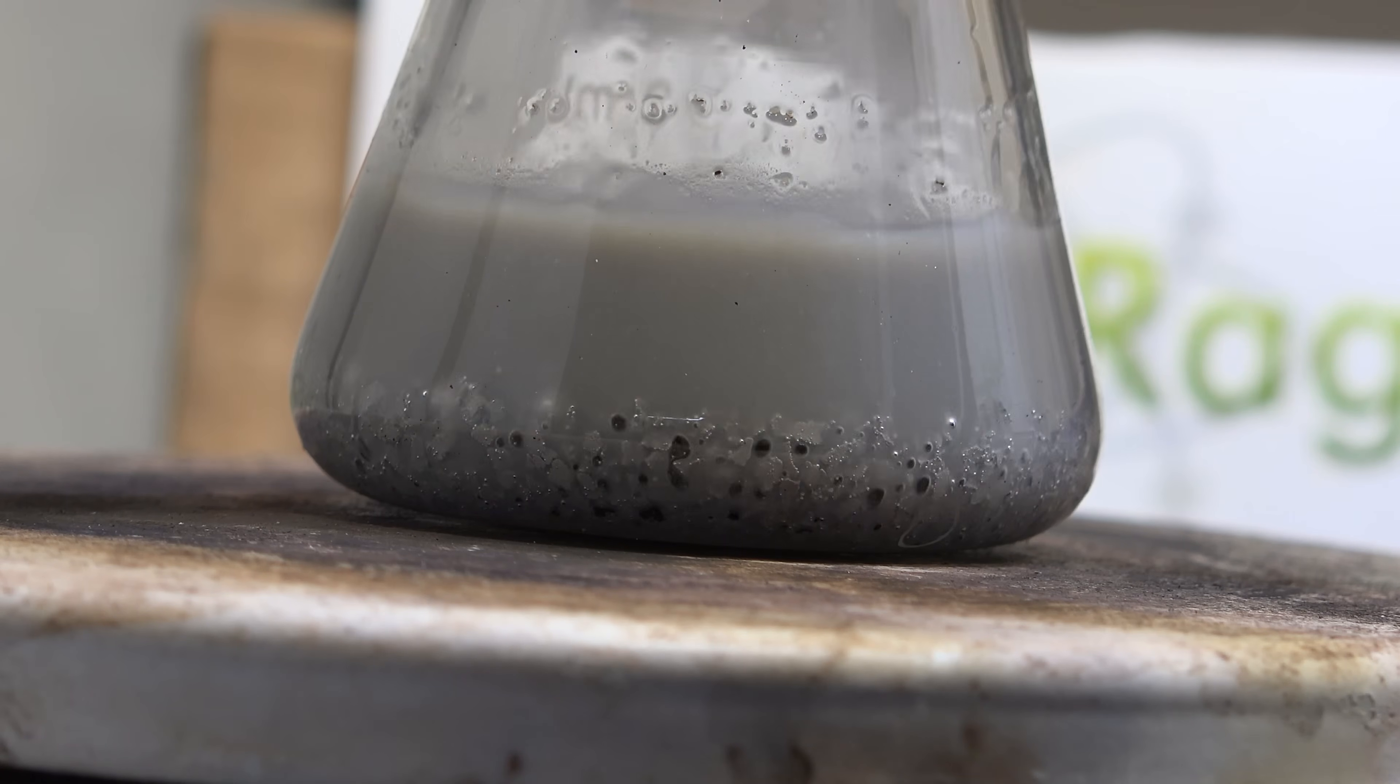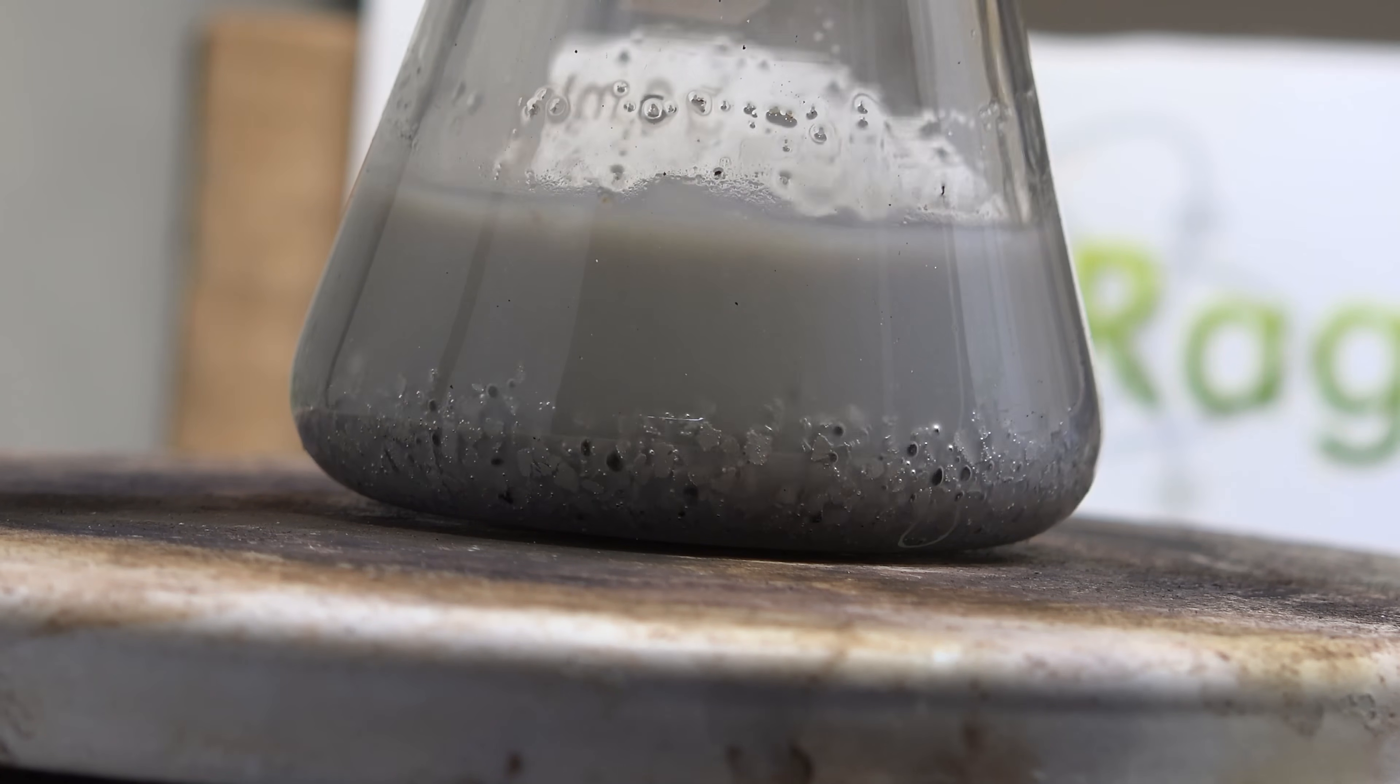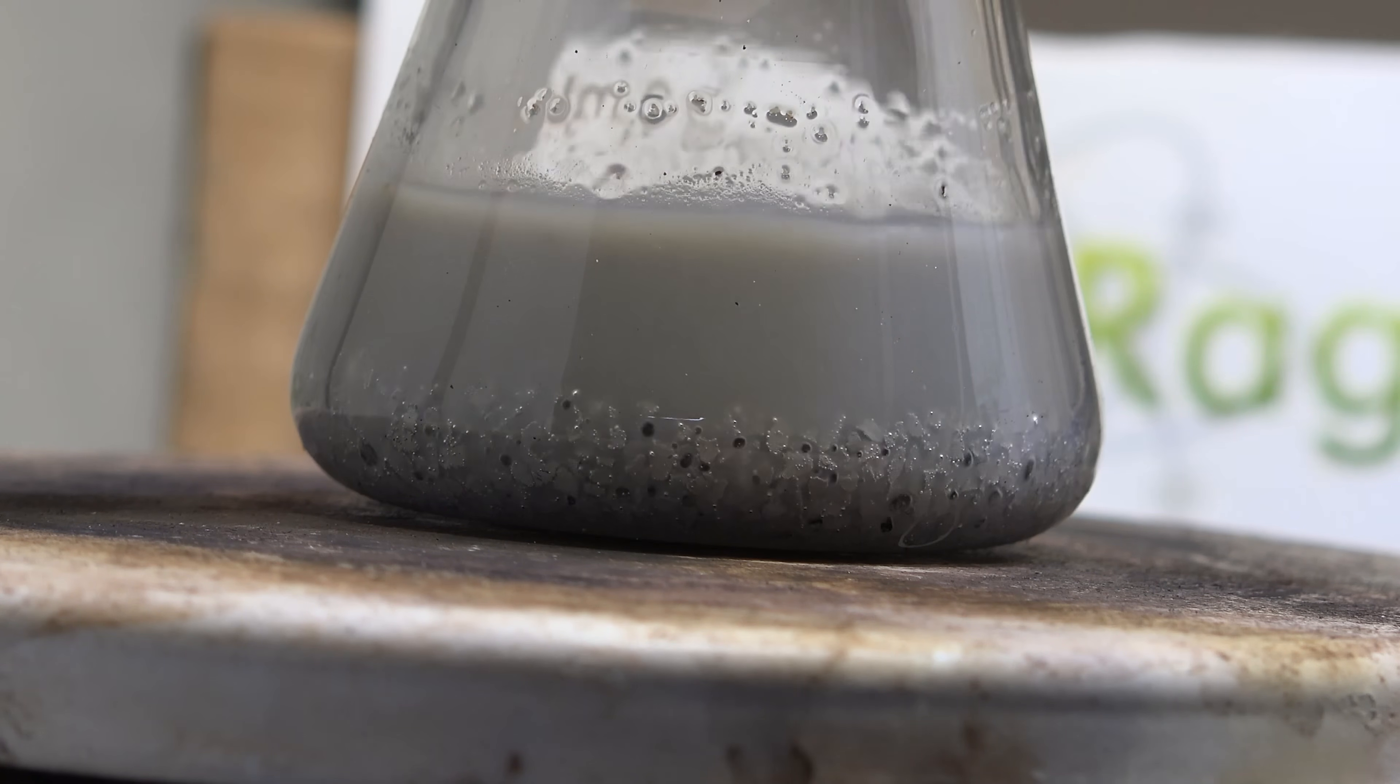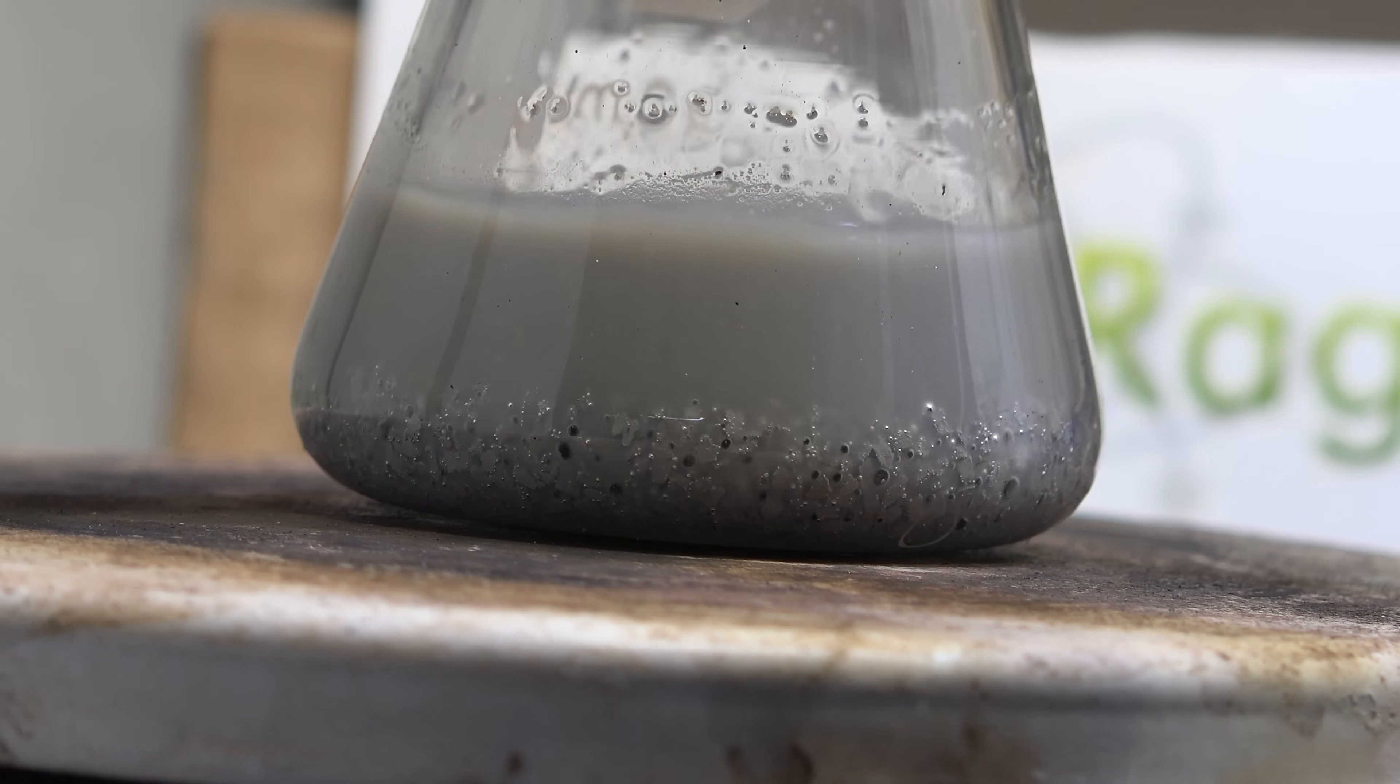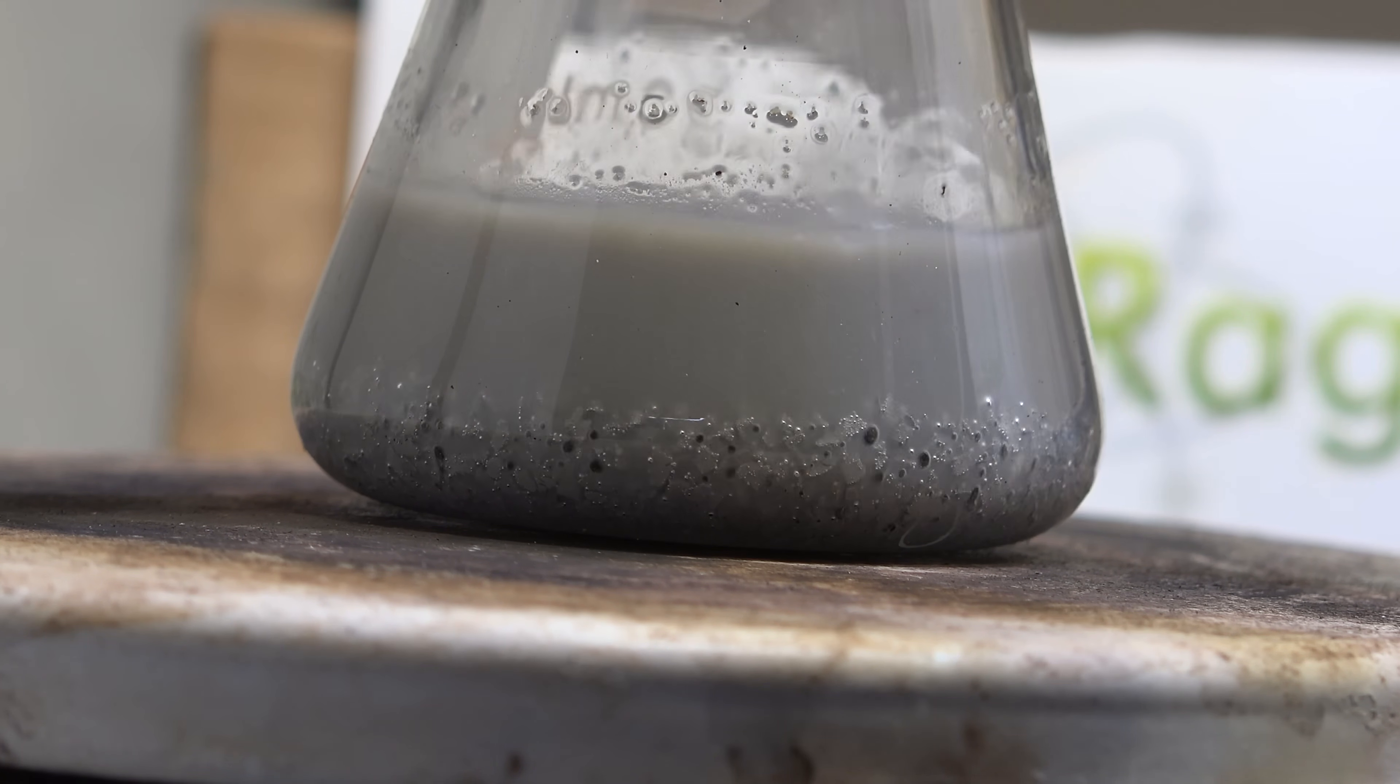But I did this not to actually make sodium this way but to prove the theory you can make sodium this way. So this video will be more about the process of research rather than the procedures of chemistry.